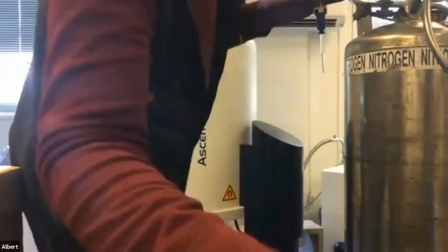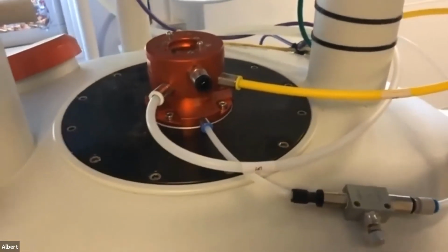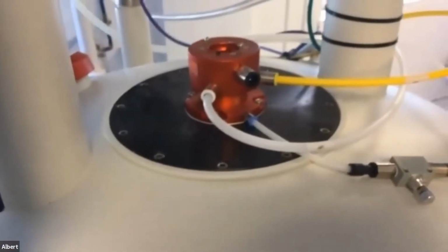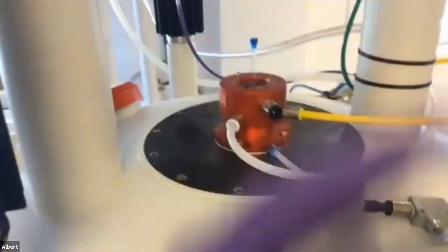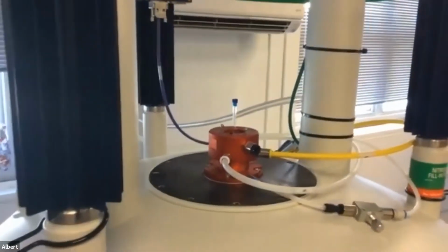Now, I'm not sure if you can hear that, but there's a little hissing noise. If you don't hear that, don't put a sample in because that's compressed air. There's a compressor across the hall. If you don't hear that hissing and you put that sample in there, it's going to drop straight to the bottom. So there's a cushion of compressed air that I'm just going to sit this here and it'll sit until I inject it. If you don't hear the hissing, don't put a sample in.